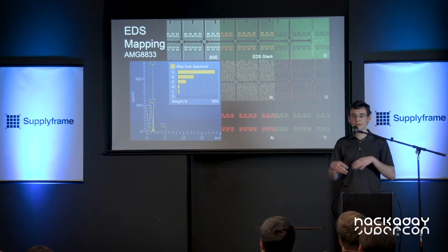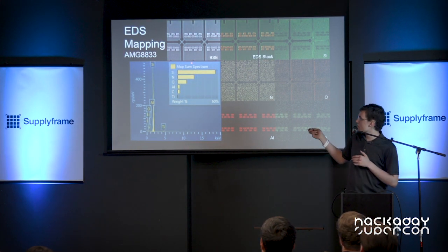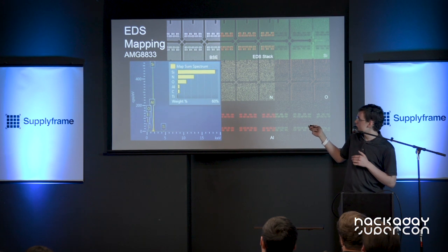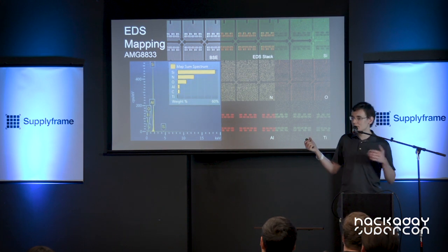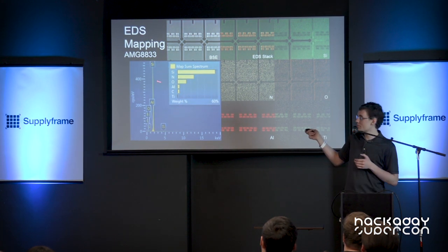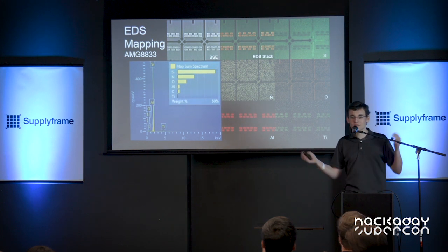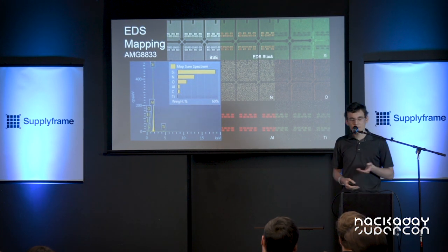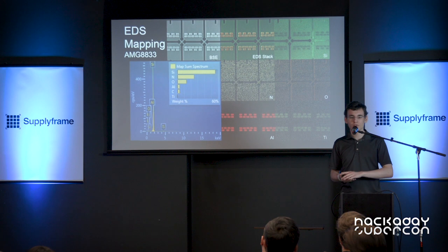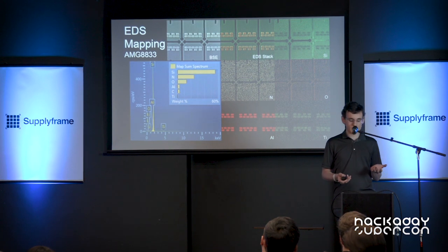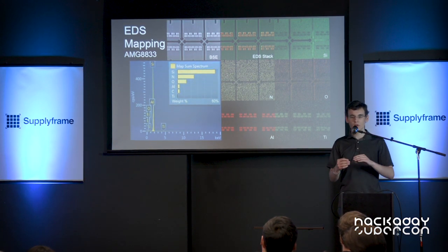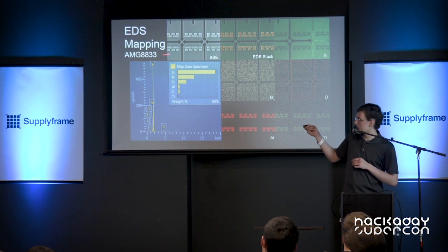The other really cool thing you can do with EDS is make a map of a sample. We'll start with a backscatter electron image — you can see some bright spots, so we know we have something heavy, and everything else is pretty dull. This is an AMG8833 thermal camera — this is about one pixel on it. Looking at the EDS information, we can see we have a lot of silicon everywhere, which is not a big surprise — it's a device built on a silicon wafer. Below that, we've got some nitrogen and oxygen, which are going to be various layers growing up on top of the silicon.